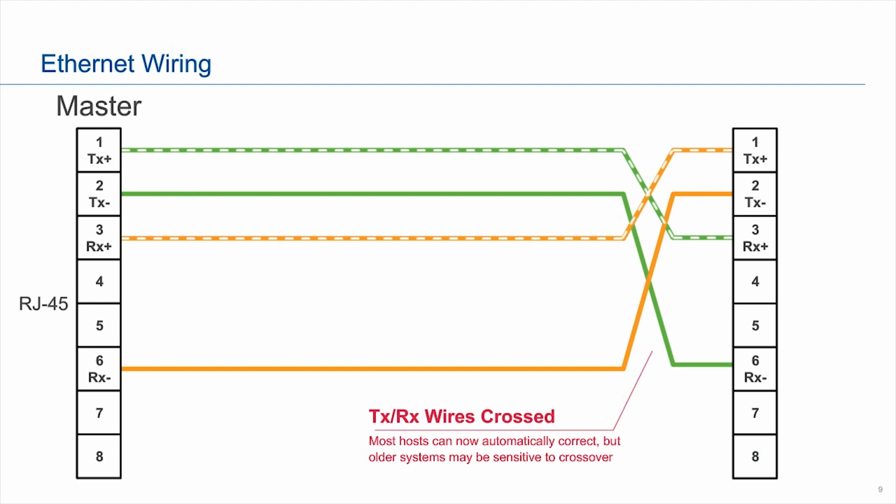And I've got a question about HART. We don't really cover HART communications in this presentation, mainly because HART is a very slow protocol. It's also really designed for 4 process variables. You'll see that there's the main process variable and 3 other secondary variables. In a GC, we have a lot of floating points that we need to communicate.